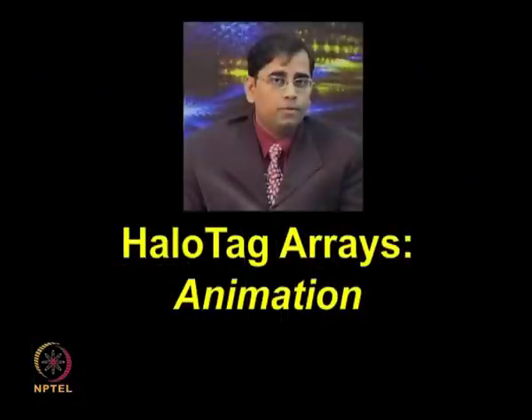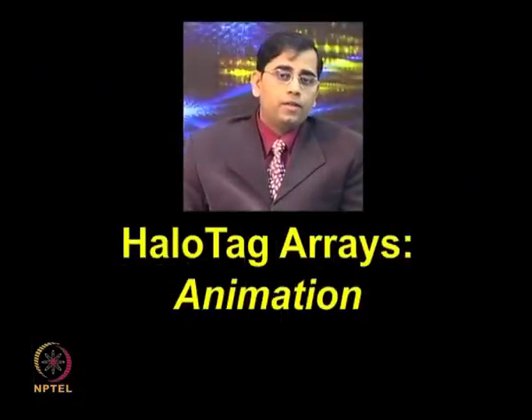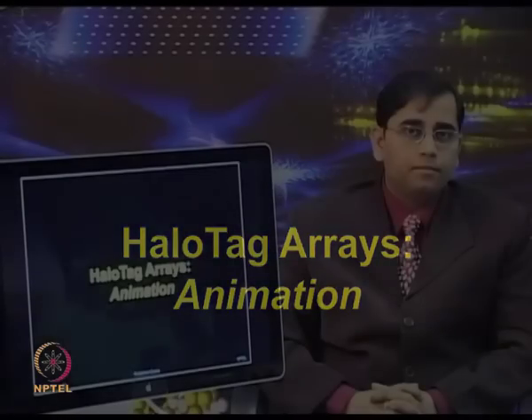So, this method not only overcomes limitation of protein purification, but also overcomes several limitations which are commonly observed in any protein array technology. So, let us discuss the working principle of HaloTag arrays in this animation.